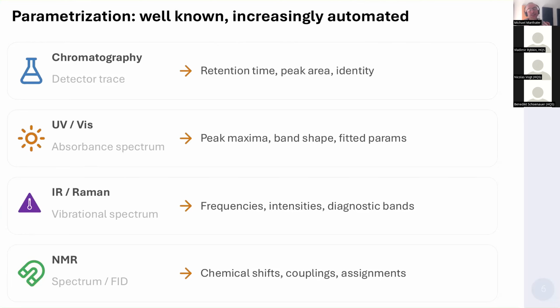So these are typical properties, parameters, which you keep out of your spectrum. However, you can extend this with a slight extension. You can easily also store very clearly defined parameters while also reconstructing at any moment the complete spectrum itself, but also reconstructing under different conditions than you originally took it, which can be quite useful.